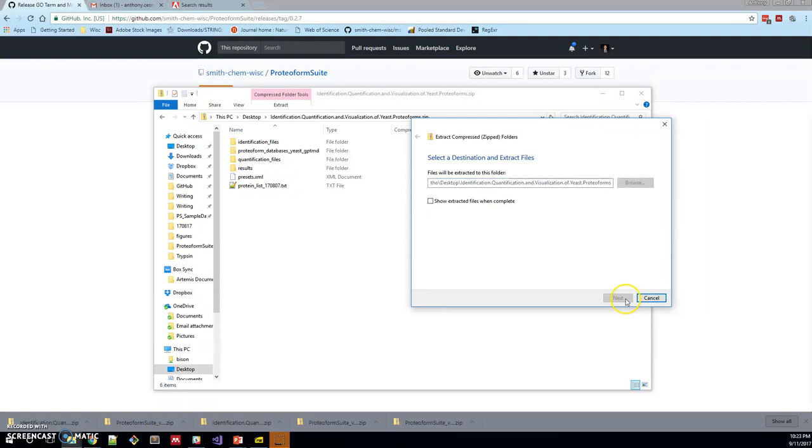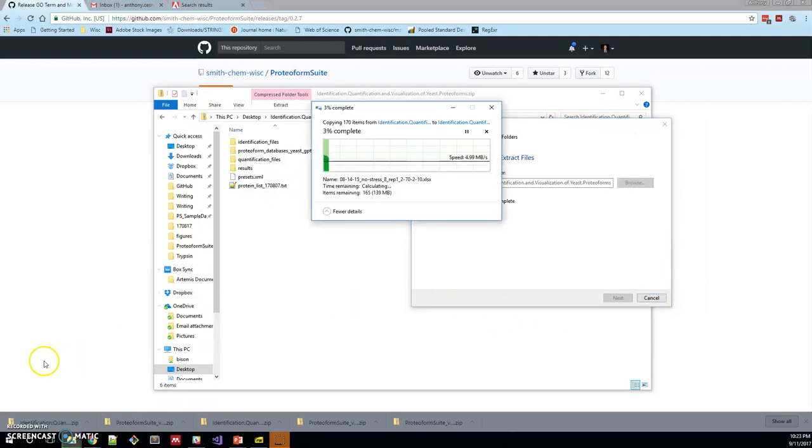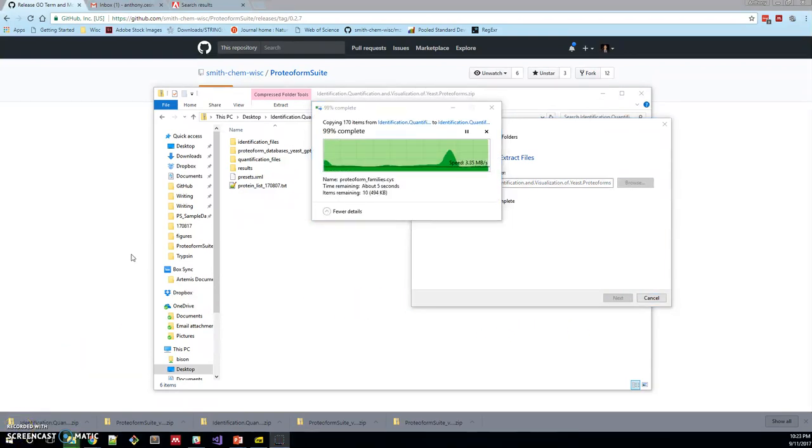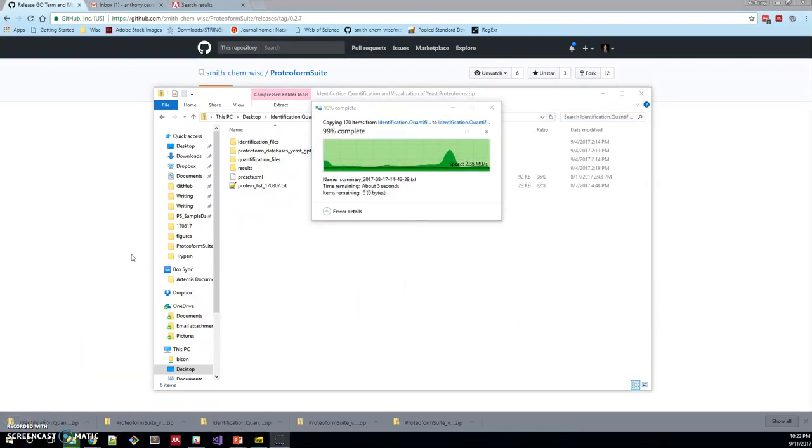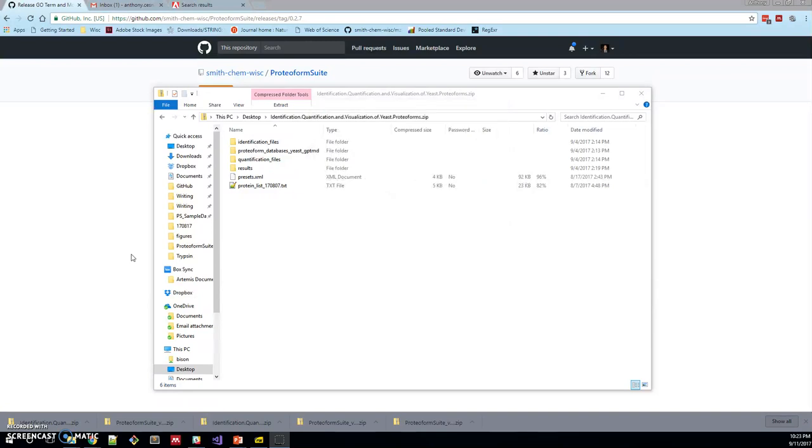And then the vignette folder is a little bit larger, so I'm going to pause while we extract this one. Click extract and that'll go ahead. We fast forwarded through time there and now that has been extracted.